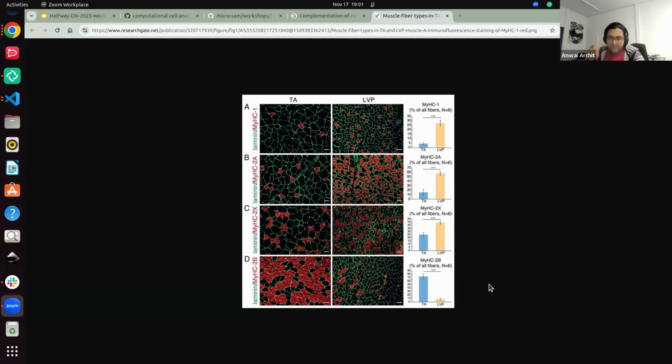Now coming back to the main question, you have to do something called tiling-based prediction. If you remember the tile size and halo, those are very important because otherwise, what MicroSAM or literally all models will do is take the image, squish it down, and see random things, which is not what we want.